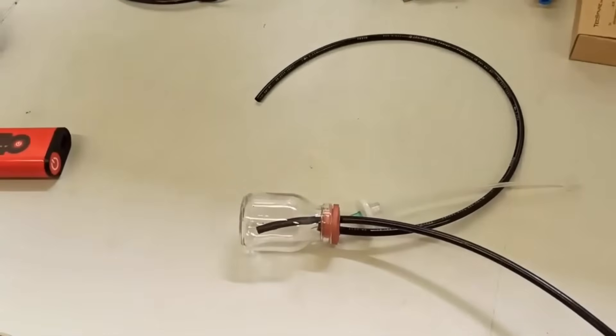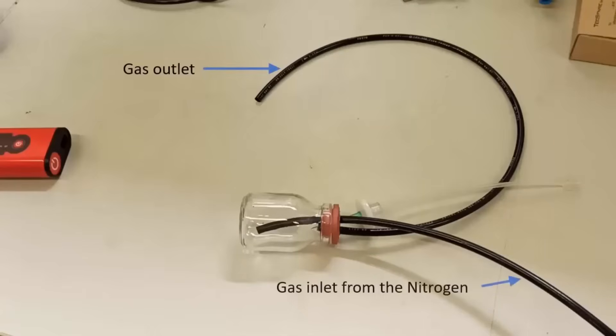The best way to connect the TechPen to the Nitrogen is to use a small glass bottle with a rubber stopper which is fitted to two tubes. One is considered as gas outlet which prevents damage to the TechPen, and the second is the connecting tube to the Nitrogen.